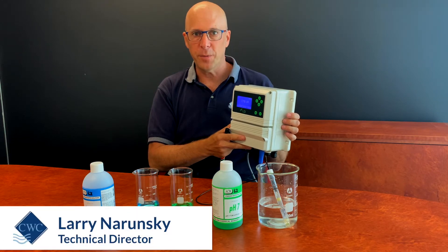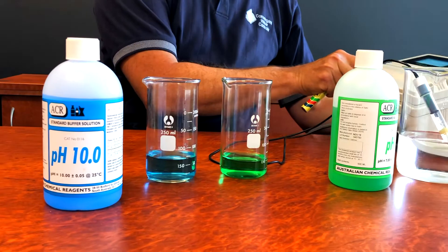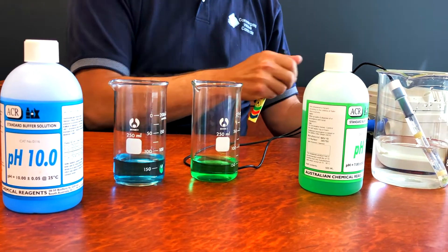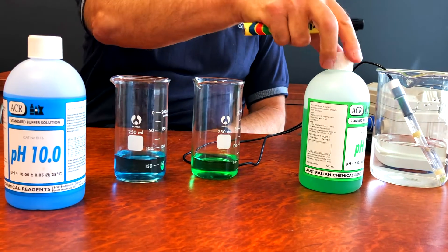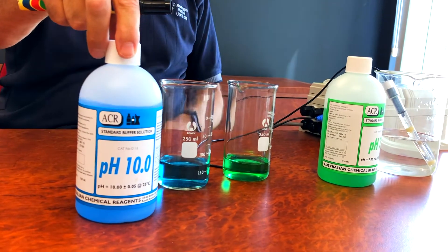Hi, I'm Larry from CWC. Today I'm going to explain how to calibrate a pH controller with pH buffer solutions. It's very important to have two solutions: a pH 7 and then either a pH 10, which I have here, or a pH 4.